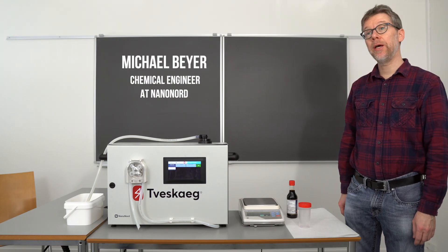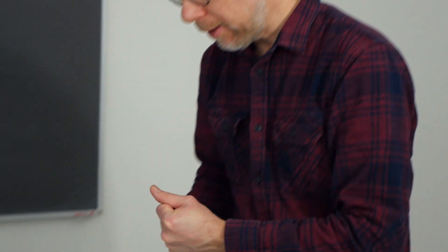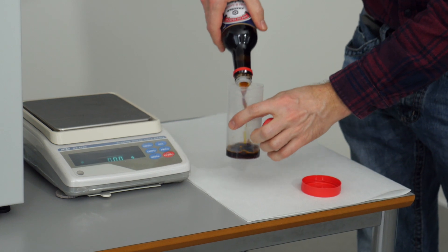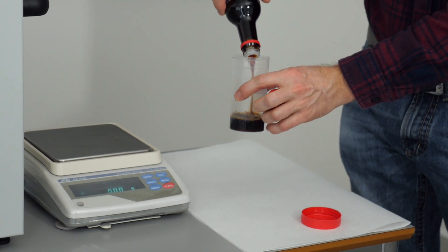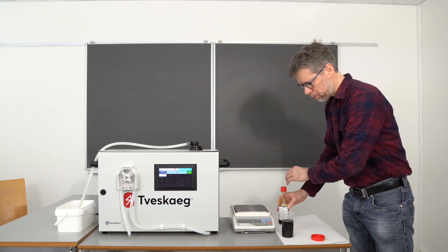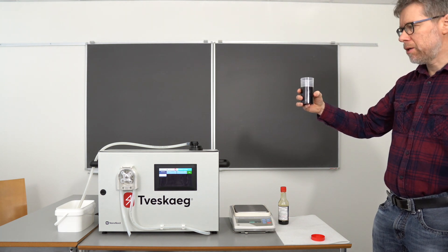This time I would like to show you the analysis of sodium, or the salt content, in soybean sauce. This is pretty straightforward — you just need a beaker to transfer the soybean sauce into it. Approximately 200 milliliters is definitely enough; you can actually use less.